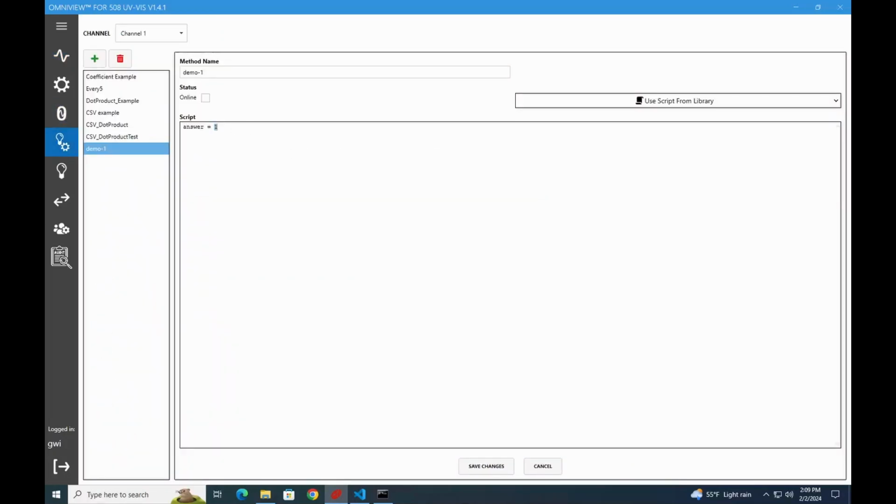We are going to set answer equal to the result of another library function called getAU at. This function needs as input as its first argument, the ID of the scan. So we will provide the reserved variable name scan. And the second argument is the wavelength at which we want the absorbance. So that's a floating point number, 416.5.